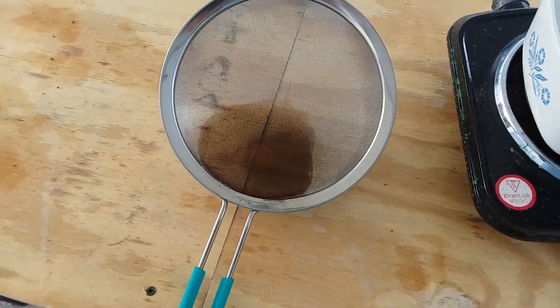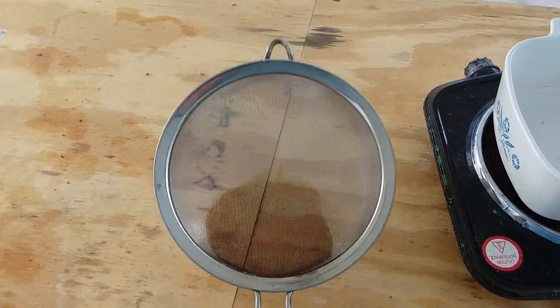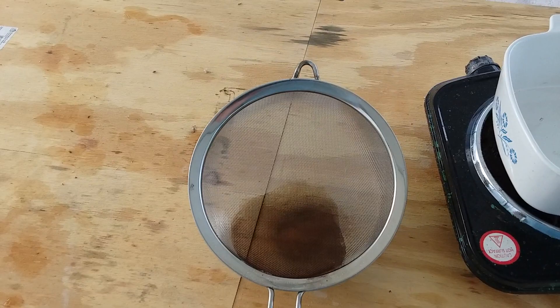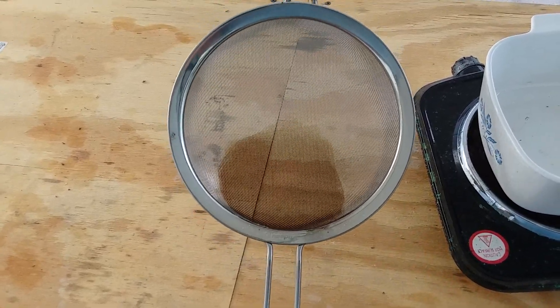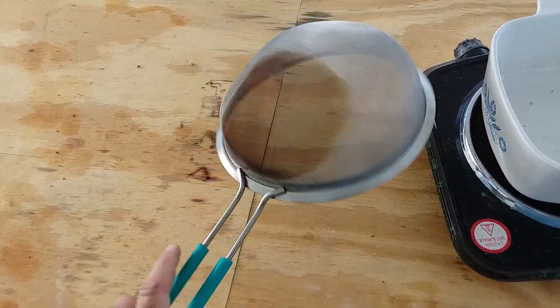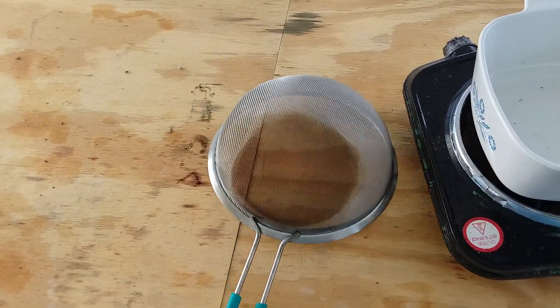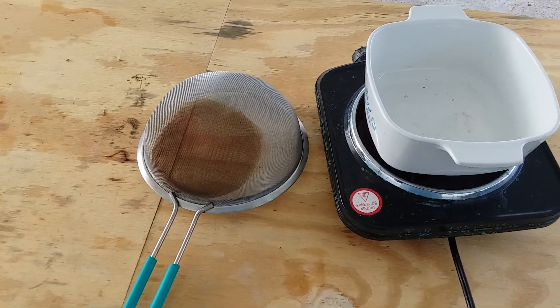So that was crazy. I can serve as a bad example for other people, if nothing else. Do not use metal sieves for gold recovery. And in general, in chemistry, it's just not a good idea. Find yourself a plastic one. So this is going to get relegated to other duties and put away far, far away from the gold recovery equipment.